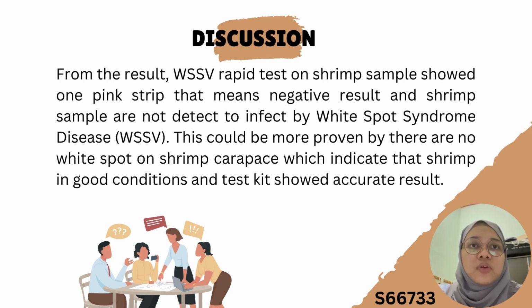This could be further proven by there being no white spots on the shrimp carapace, which indicates that the shrimp are in good condition and the test kit showed an accurate result.